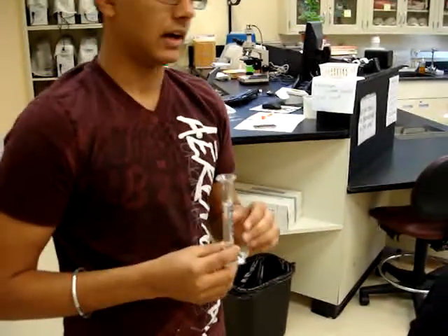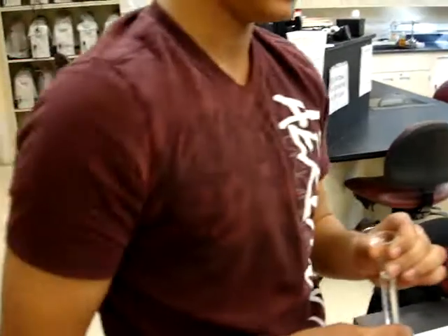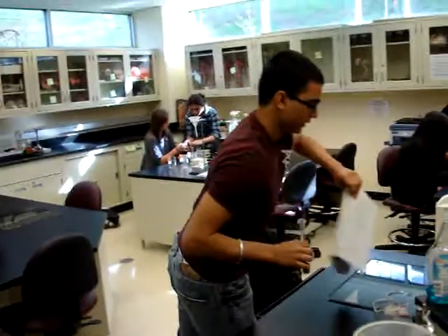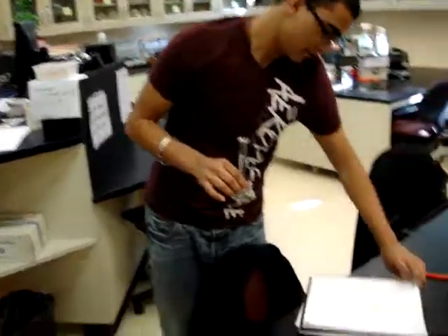We picked out 20%, 10%, 30%, and 5% concentrations. This is the 20% if I'm not mistaken — actually, this is 10%. 10% solution.